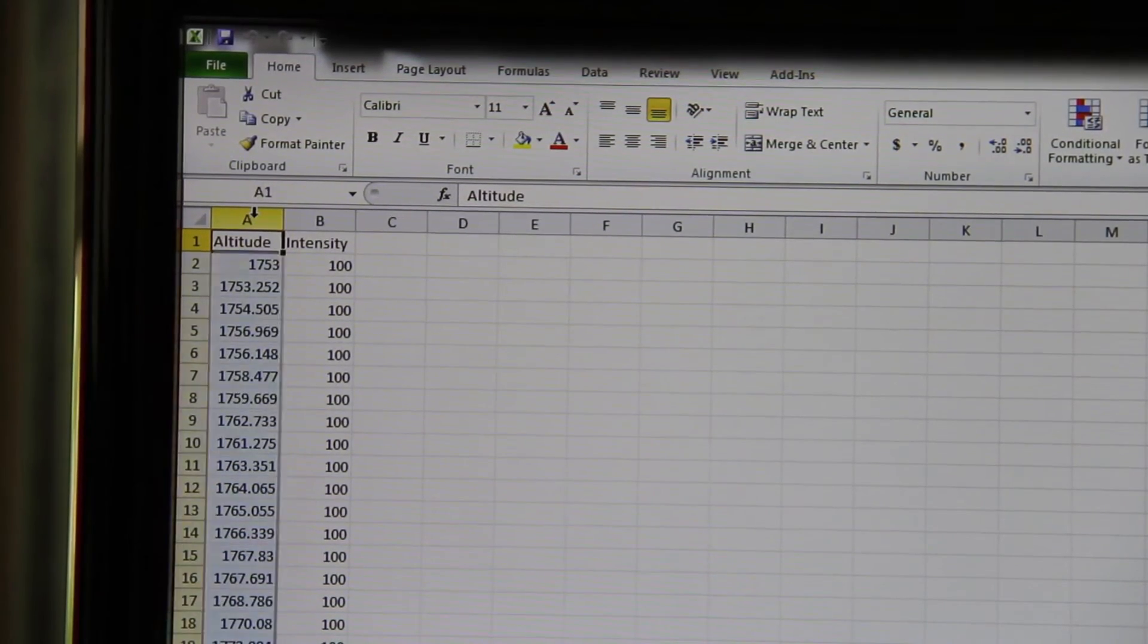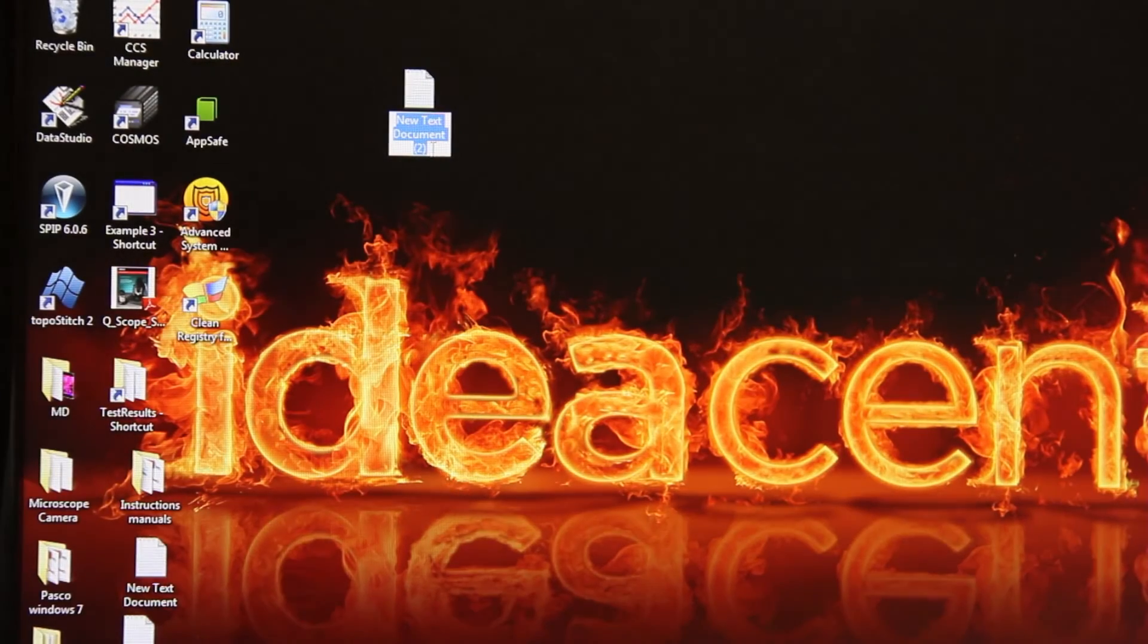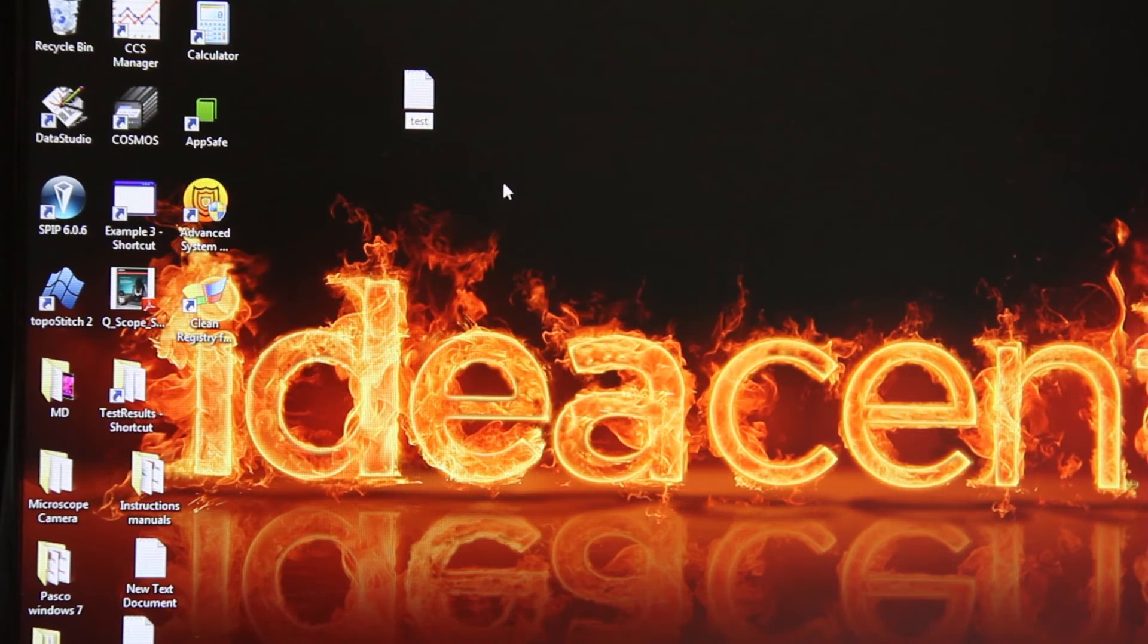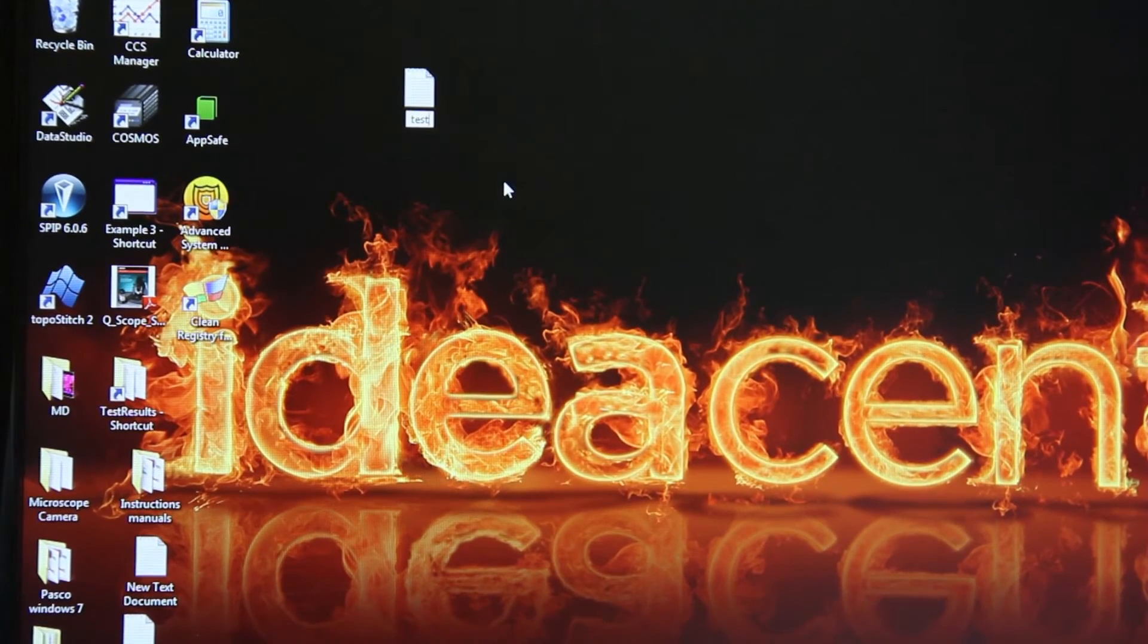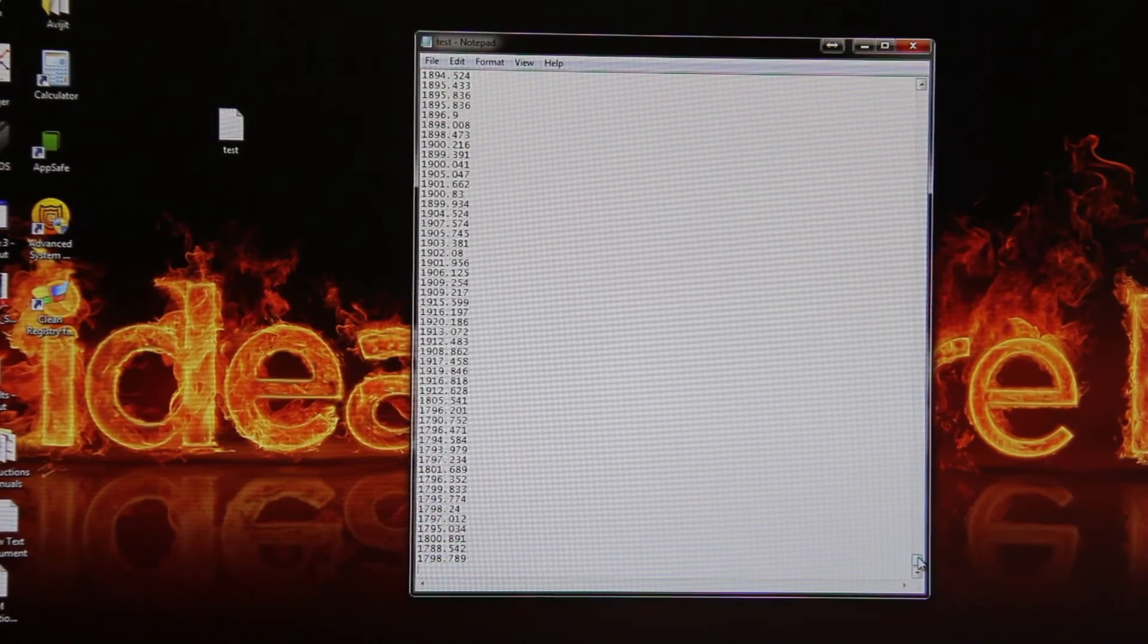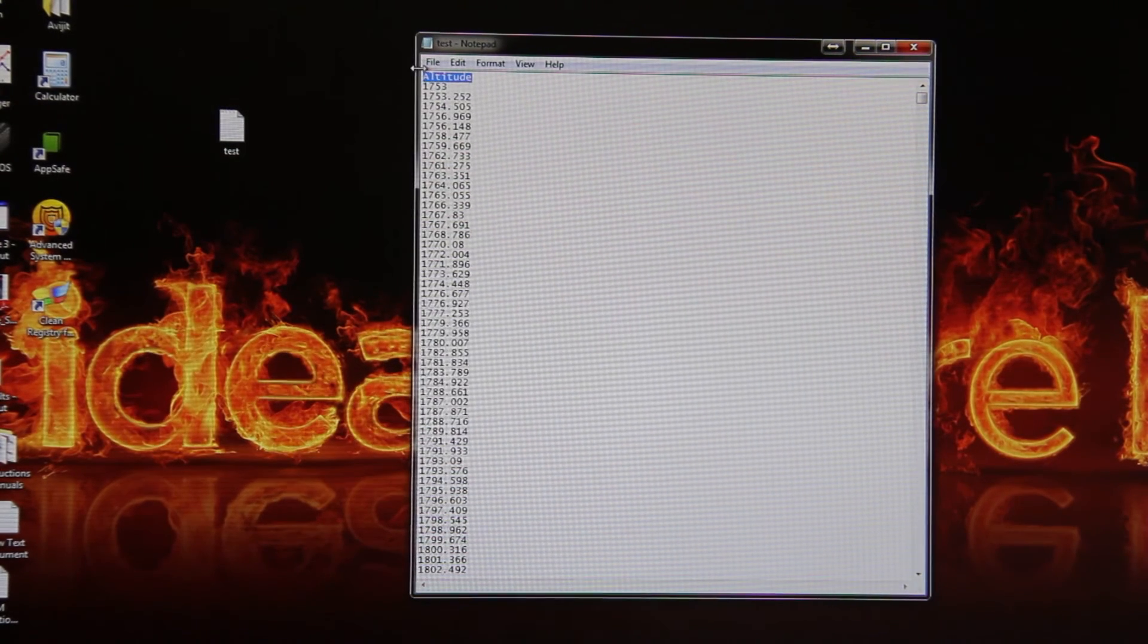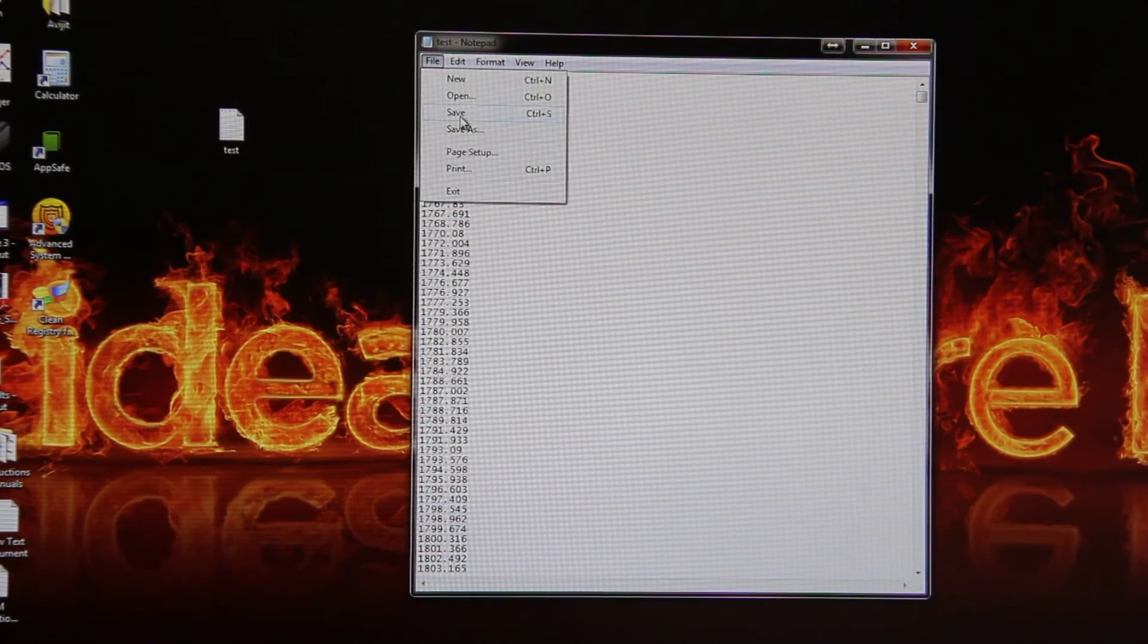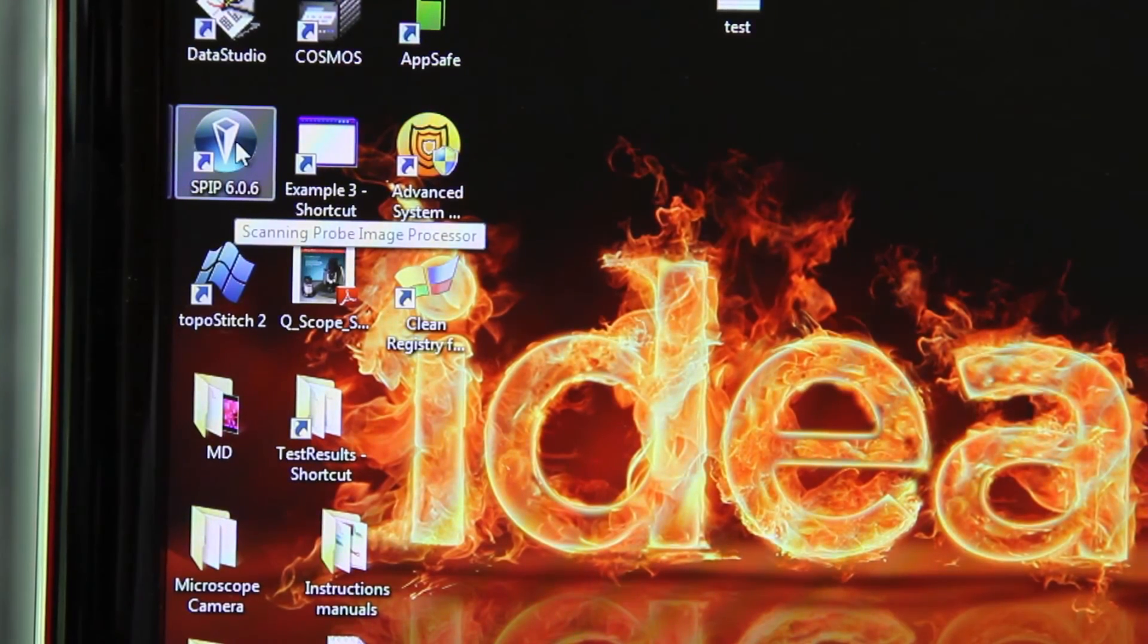Copy altitude. Open a new text document. Rename it as test. Paste all of your data. Go at the top, remove altitude. Save your file. Open SPIP 6.0.6 from desktop.